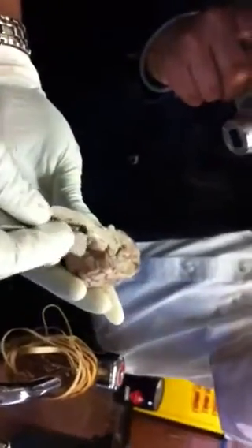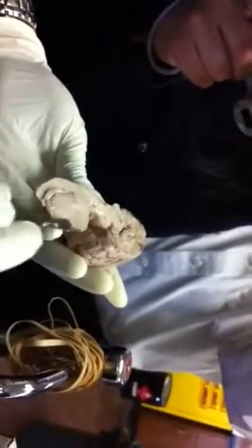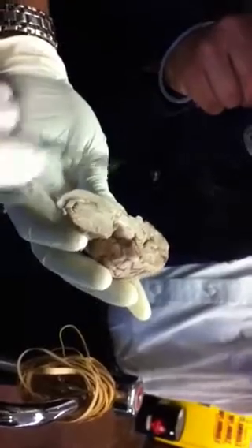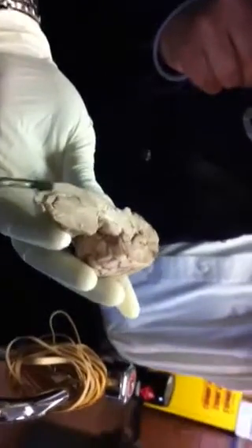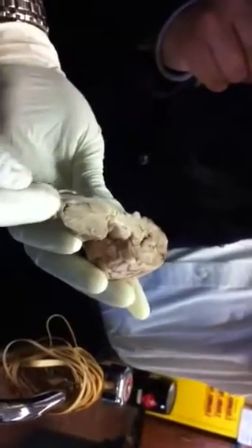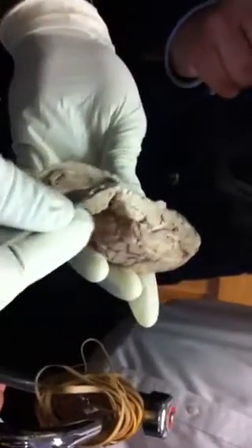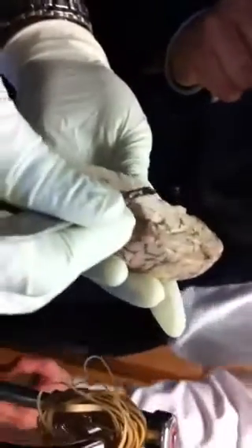On this side, can you all see it? What's this? Cerebellum. What's this? Spinal cord. The first thing here is the spinal cord. Now, this is what? Medulla. Now, the pons is, you see this bulb? That's the pons. So now, just above the pons is the what? Midbrain. So midbrain is this.